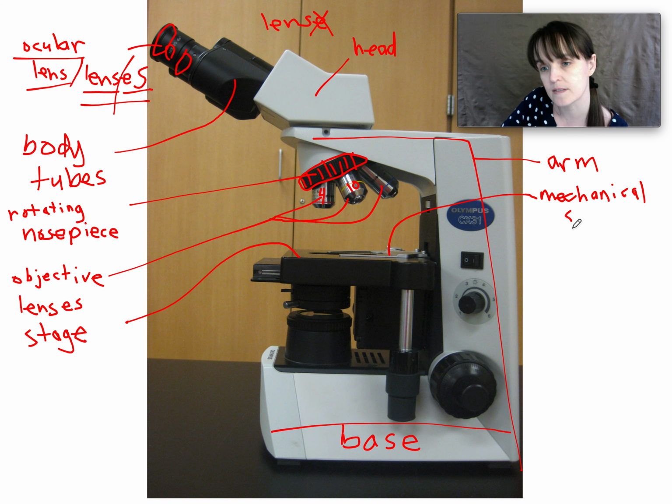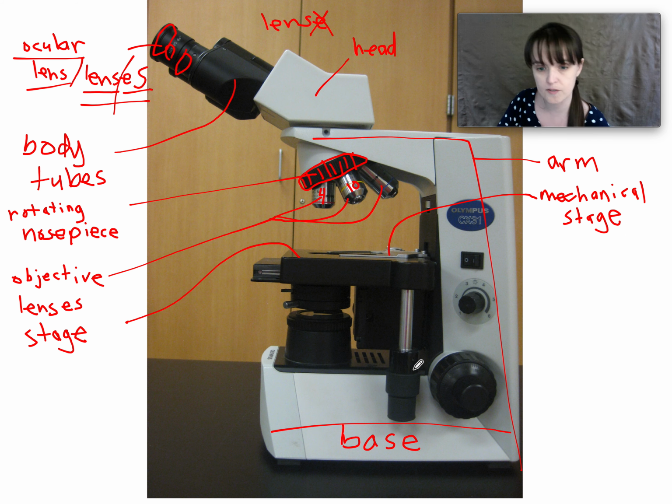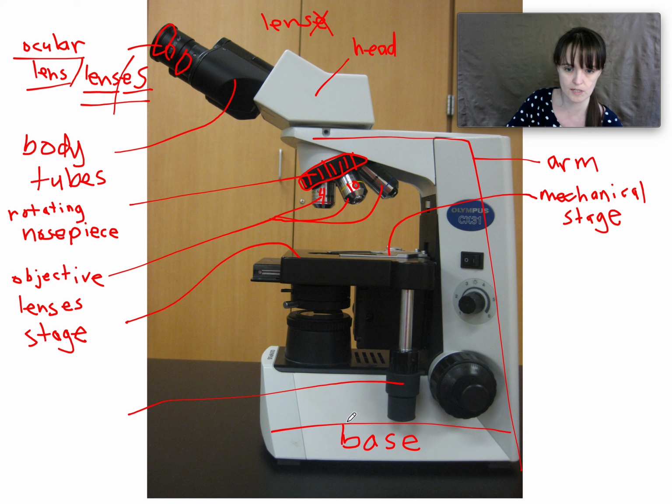M-E-C-H-A-N-I-C-A-L, mechanical stage. Got it. Okay. Next, the mechanical stage controls, going this way.